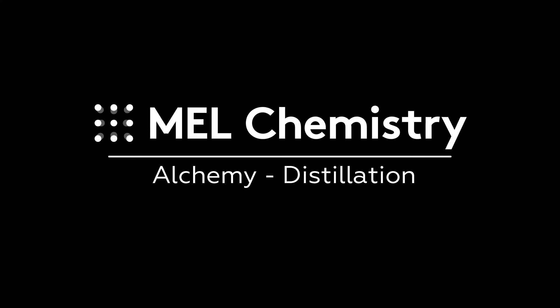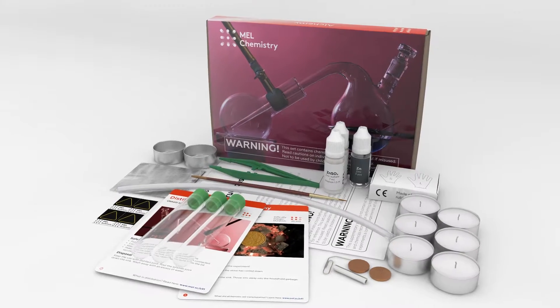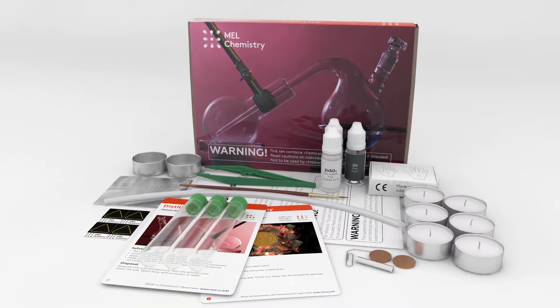Welcome to the wonderful world of chemistry. Today, with the help of the Alchemy set by Mel Chemistry, we will obtain an essence from a fruit juice.